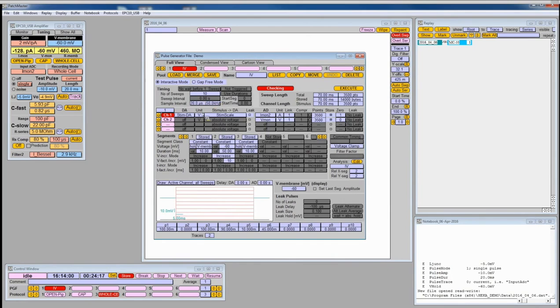I want to demonstrate quickly a couple of things that you can change here and where to change them. For example, the number of sweeps or steps can be changed here. You can set it to 12 if you want to have two more steps. The acquisition frequency is basically shown here.